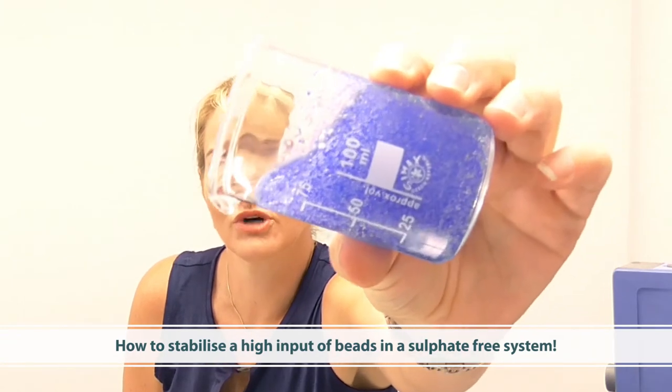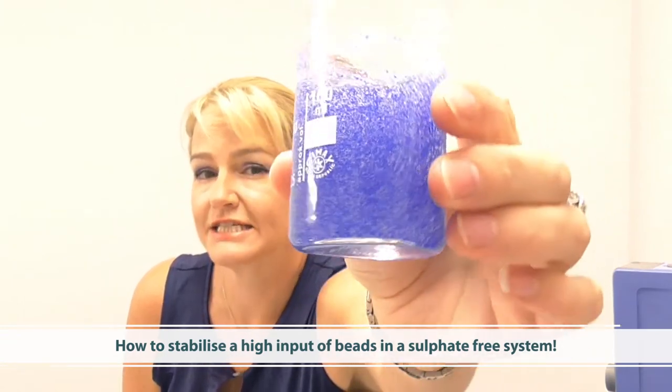Hi, I'm Melinda Cowley, the Director of the Institute of Personal Care Science. Today I'm going to help you overcome a tricky formulation challenge when formulating with visual beads, and I'm going to be showing you specifically how to create a beautifully viscous and stable sulfate-free foaming cleanser. Here's the product we'll be creating — you'll notice I've used some beautiful bright blue beads in a very high quantity to show you that we can stabilize these effectively in a sulfate-free system. Let me show you how.